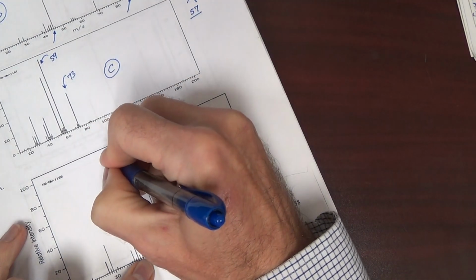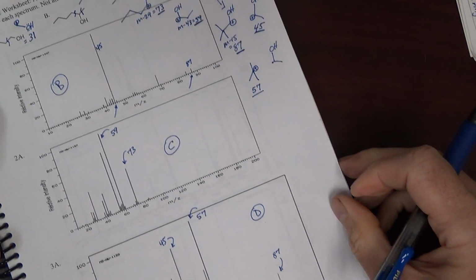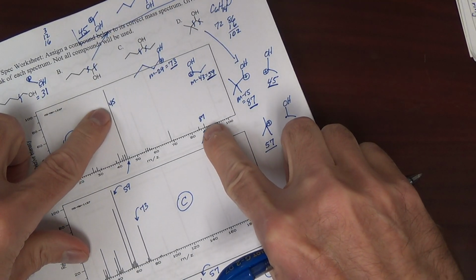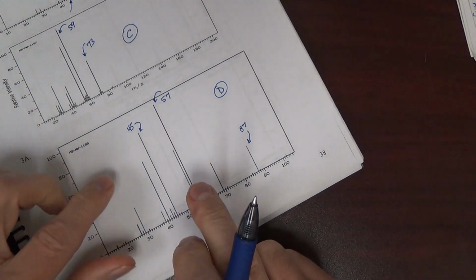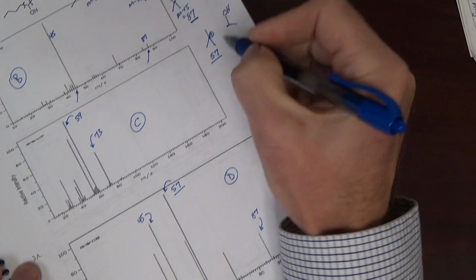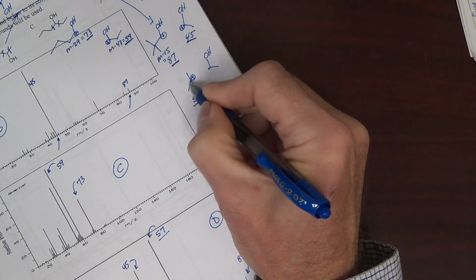Yes, it contains the 45. Just like the first spectrum contained the 87 and 45 for B. The difference being that the third spectrum also contains the 57, which we see could come from forming the tertiary cation.